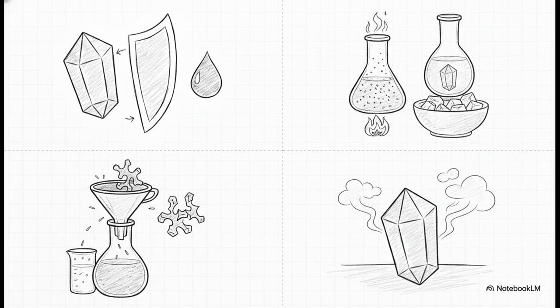They need to be either completely soluble, so they stay behind in the liquid during crystallization, or highly insoluble, so you can just filter them out while it's hot. Finally, it should be moderately volatile, so your final crystals dry easily. Finding this unicorn solvent often takes a lot of trial and error, relying on the classic like dissolves like rule. And if you ask any tired grad student, that can literally mean a highly frustrating afternoon of testing vials until you finally find the magic liquid that works.